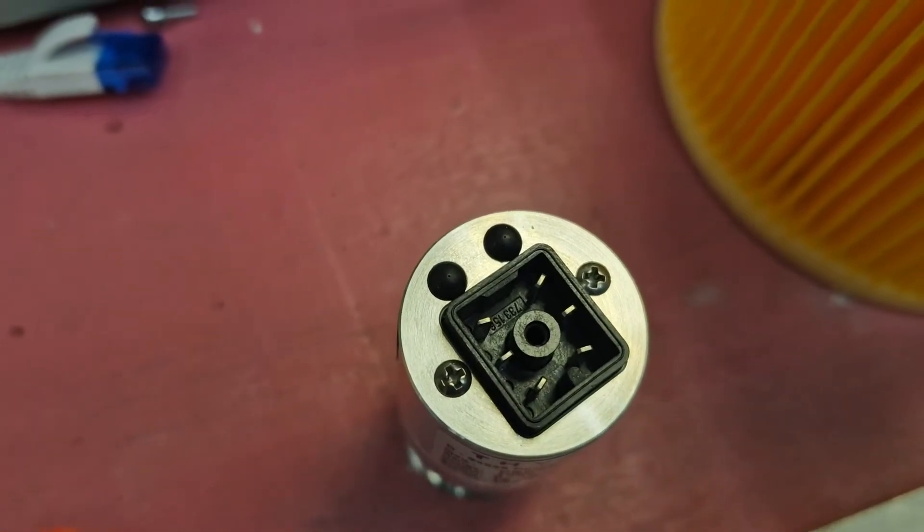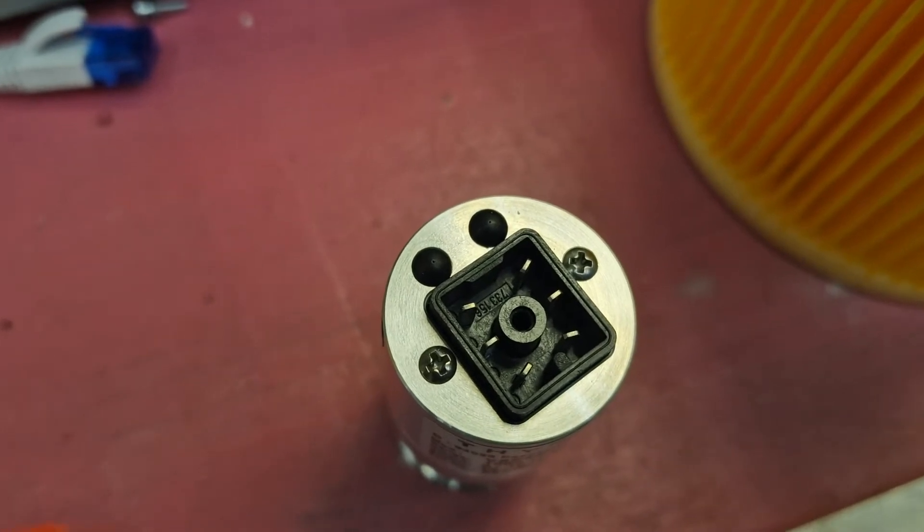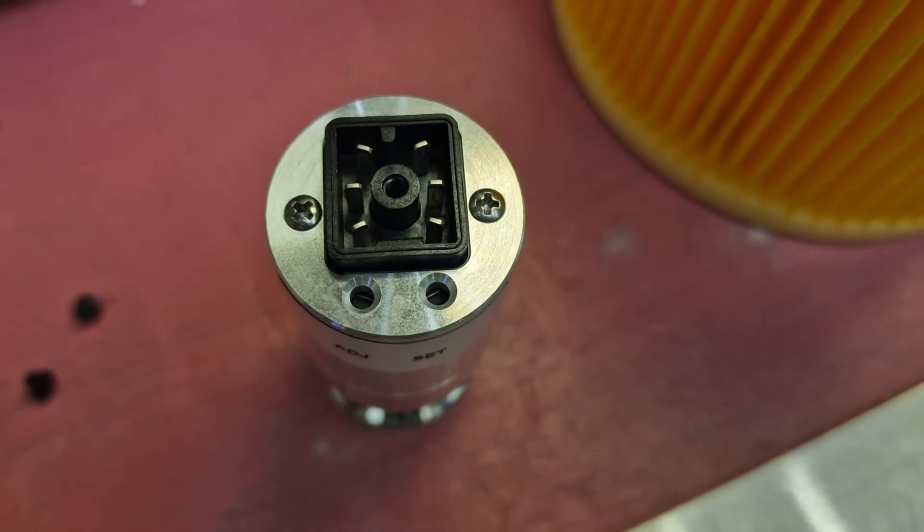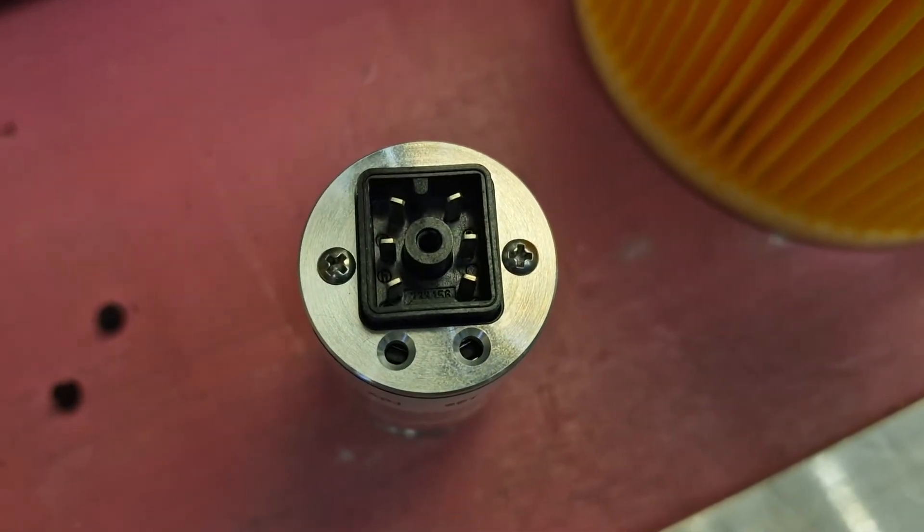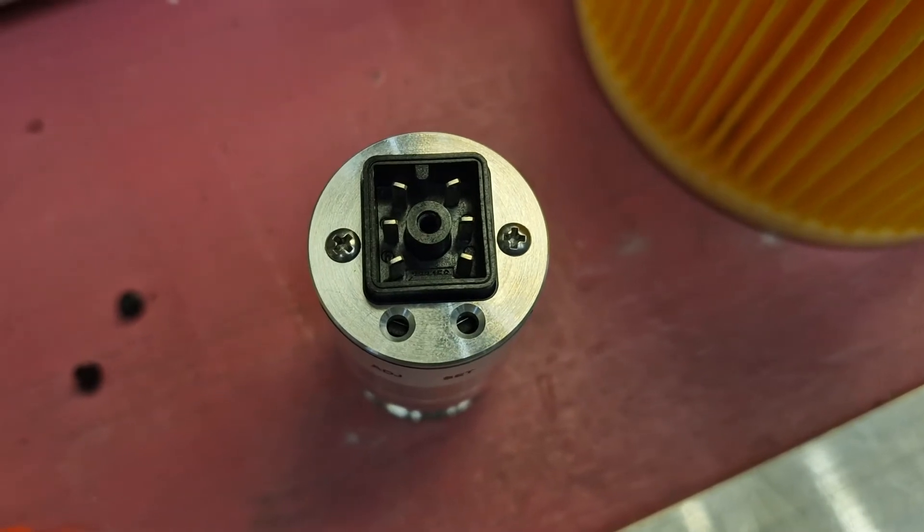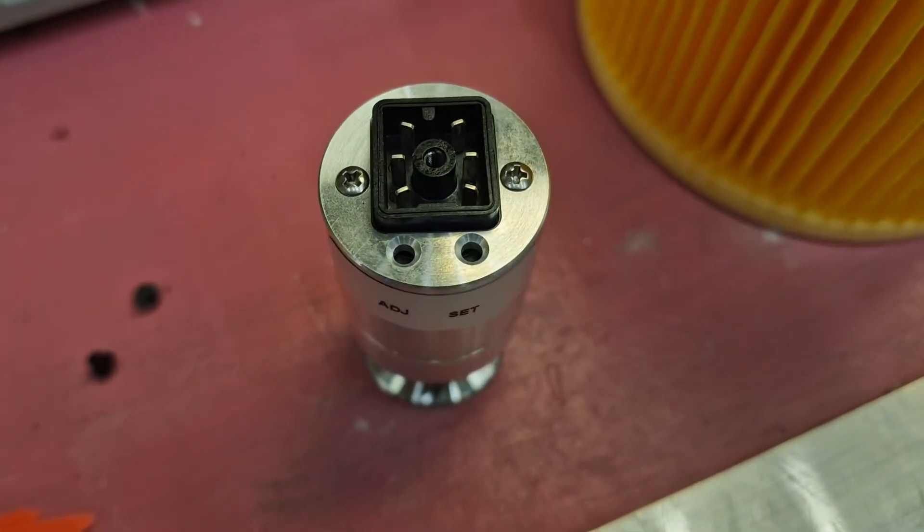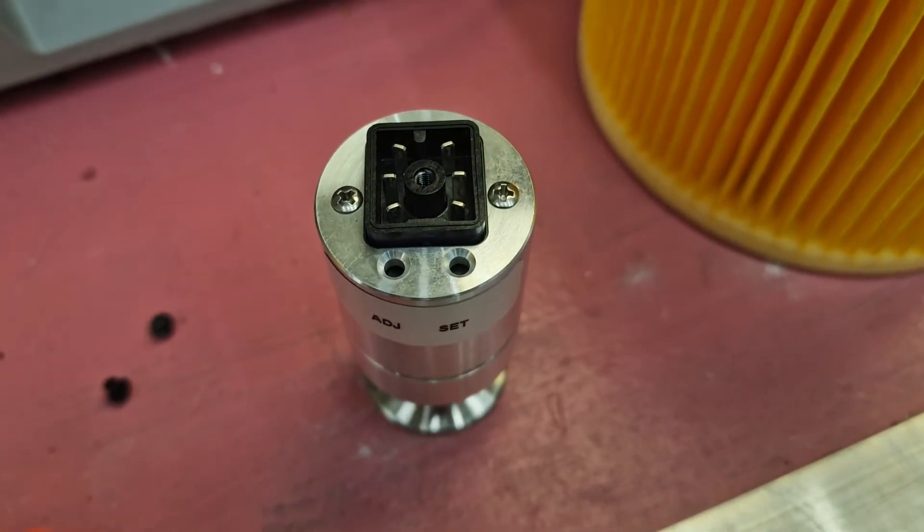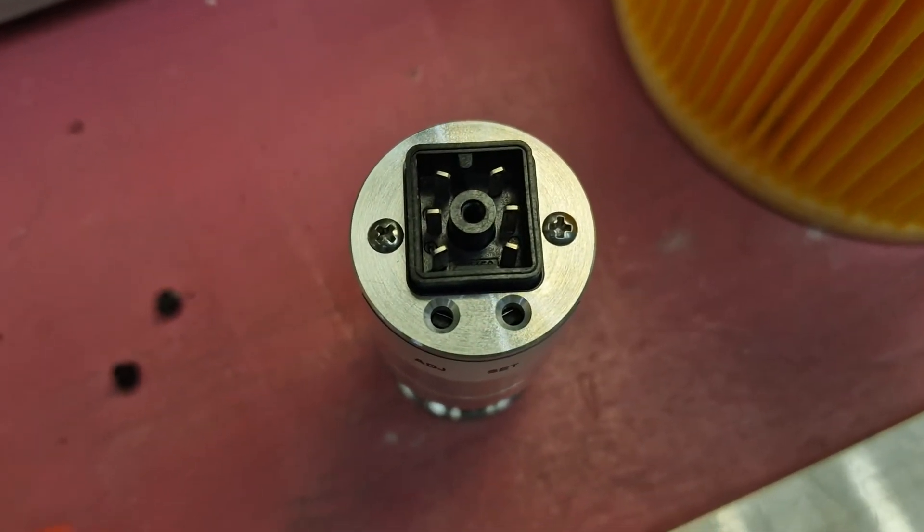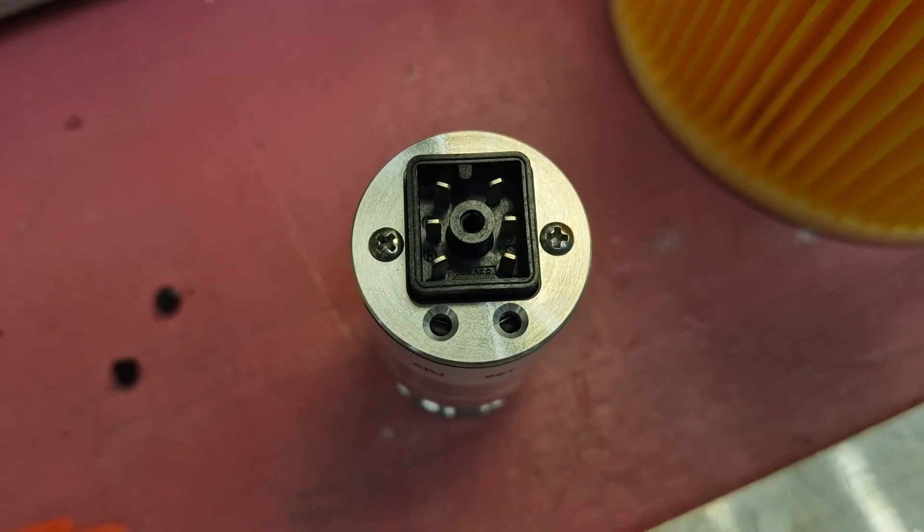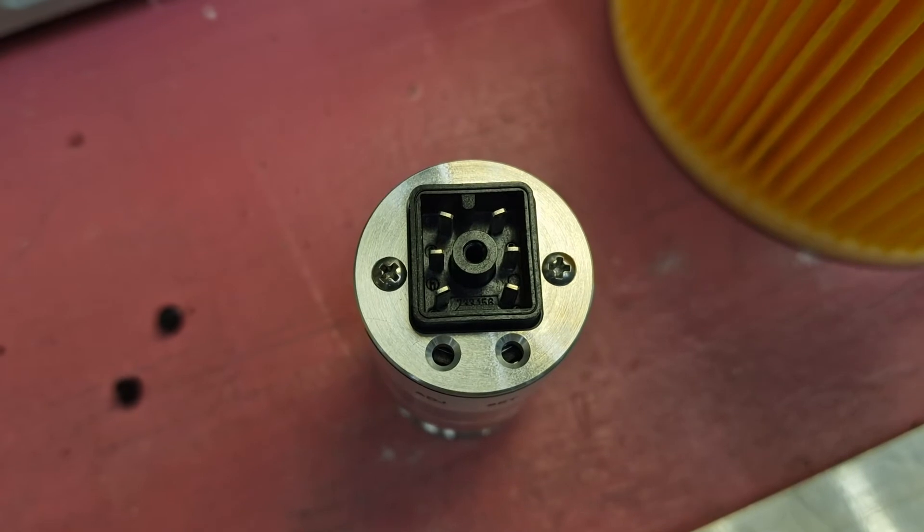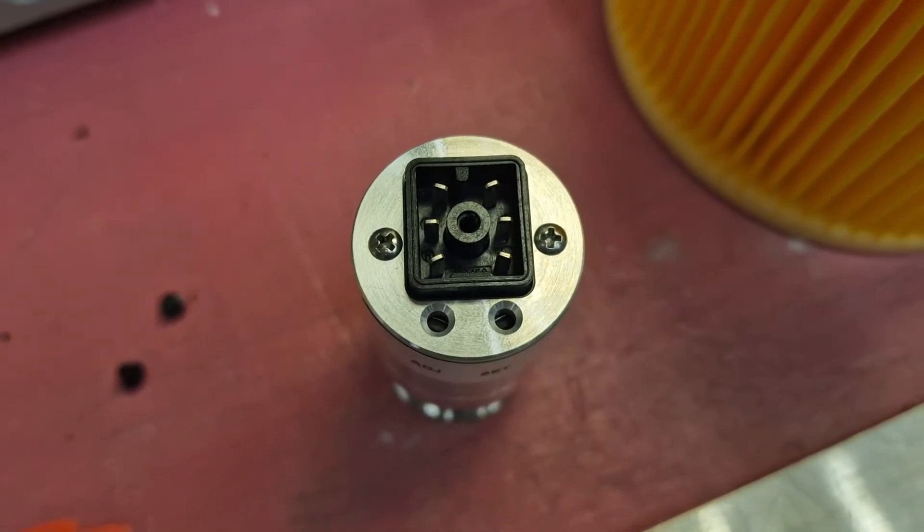If that didn't help then remove the two small black caps on the sensor and then inside the little buttons. With a small stick press for about five seconds the adjustment button. This will reset the sensor and it's another chance to make it work, otherwise it will have to be exchanged.